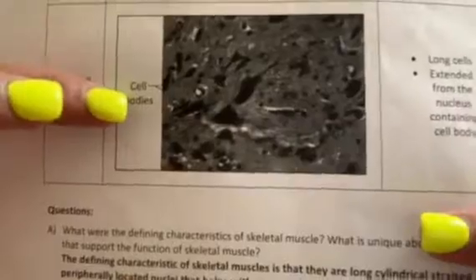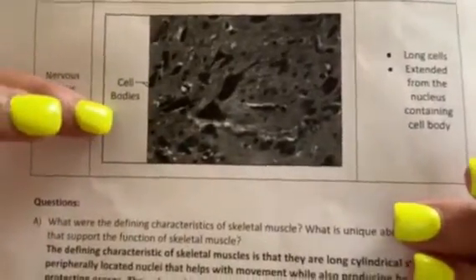In the lab, when we talked about the nervous tissue, I have a picture here. You can't really see it, but we had to label and identify the cell bodies. The cell bodies of the nervous tissue are long cells, and they extend from the nucleus.